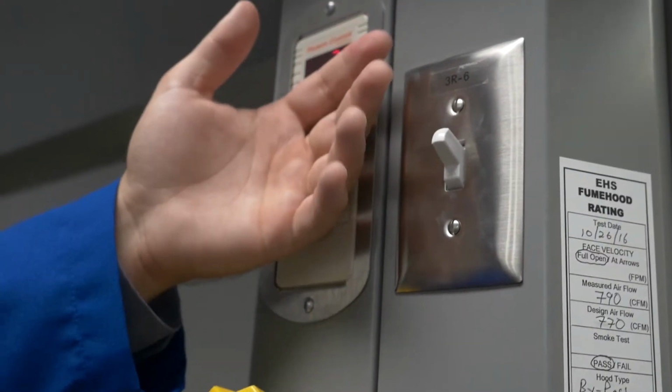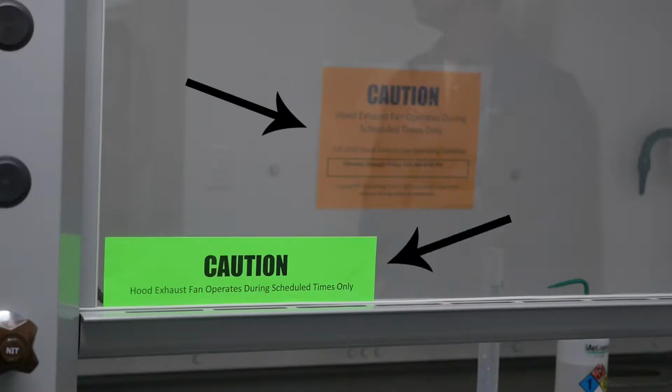On-off fume hoods have a power switch that must be turned to the on position before use. Some fume hoods run on a schedule where they only run during certain times of the day. All fume hoods running on a schedule are posted in the back and on the front sash of the hood. Finally, some fume hoods run on a twist timer, where once the timer runs out, the fan on the fume hood turns off. The key takeaway is that it is essential that there is power when working in a fume hood, or else it could lead to a potential chemical exposure.